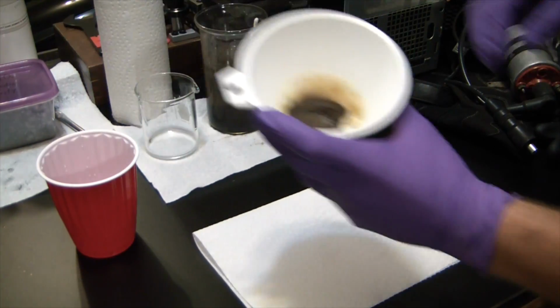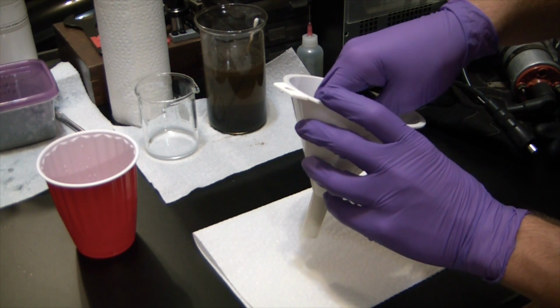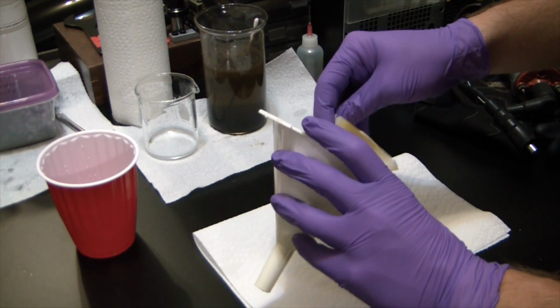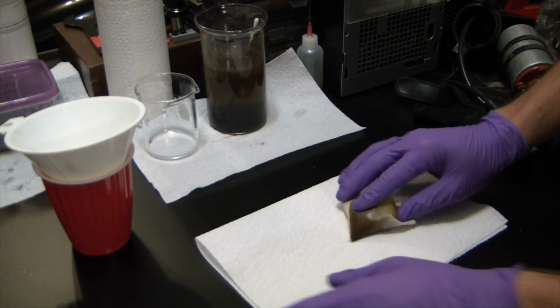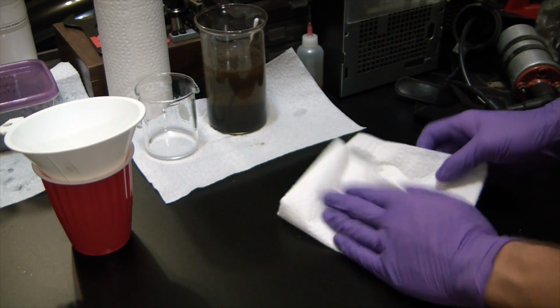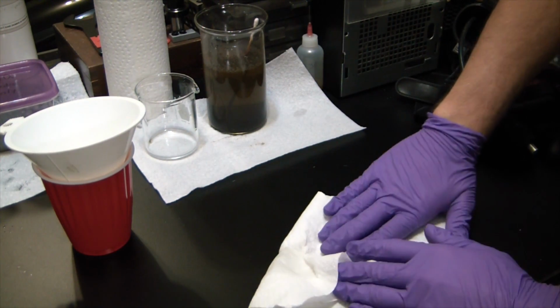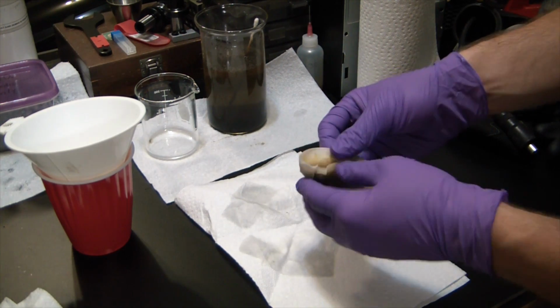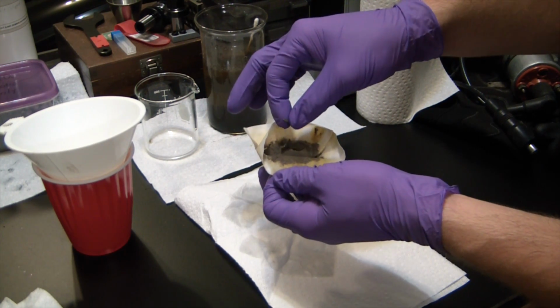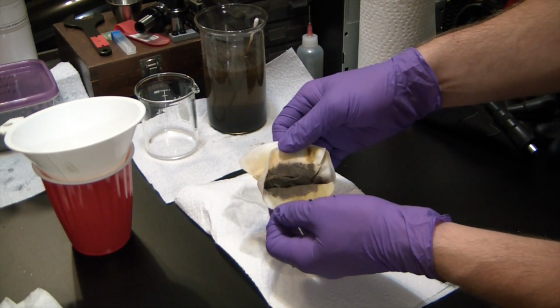Now that the majority of the water is out of the silver oxide and it's been washed a few times, I'm just going to remove it from the funnel here. Try not to rip. Try to push as much of the water out of it as possible. You can see it's staining the filter paper pretty well. Alright, so there is our silver oxide, ready to be converted into pure silver metal. Well, probably like 99.9 or something around there.